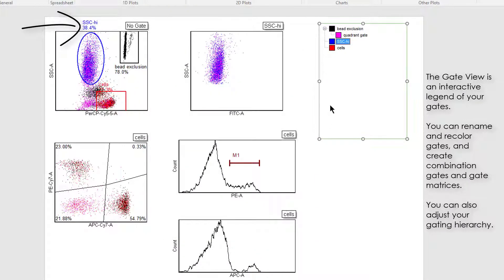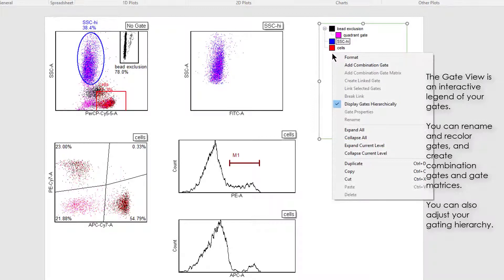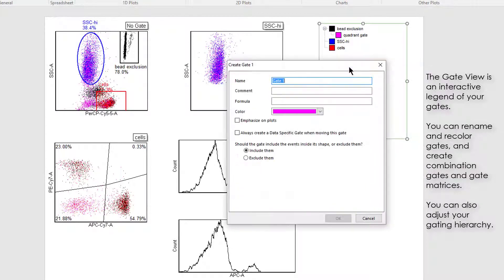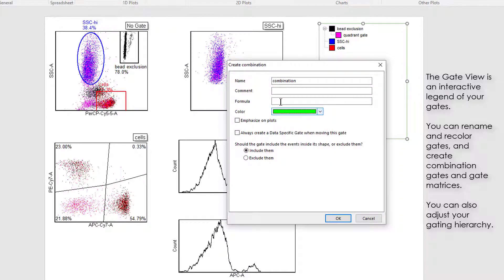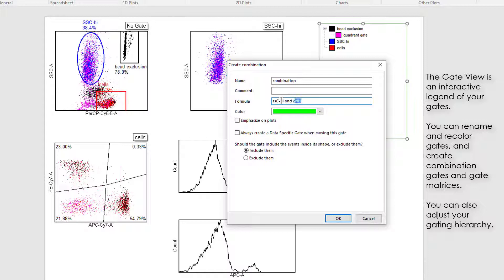You can also make combination gates. You can use all Boolean operators including AND, OR, NOT, and XOR. Notice the auto-fill so you won't have to type out the complete name of your gates.